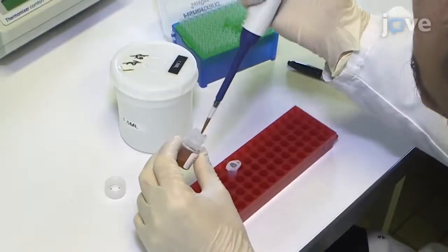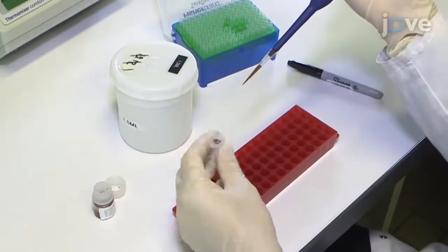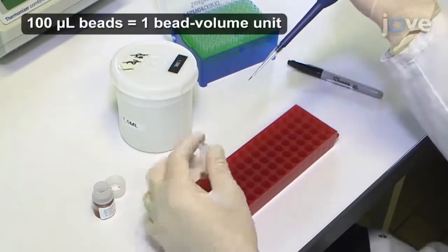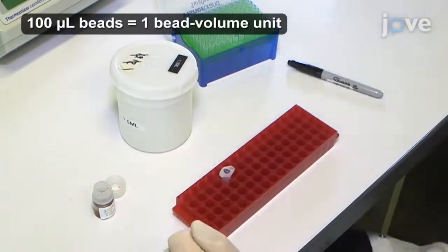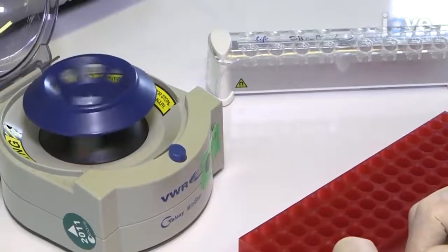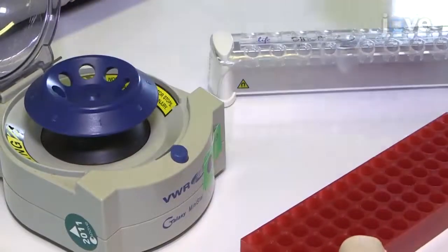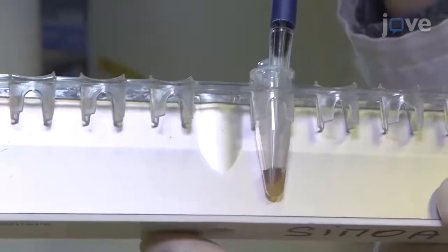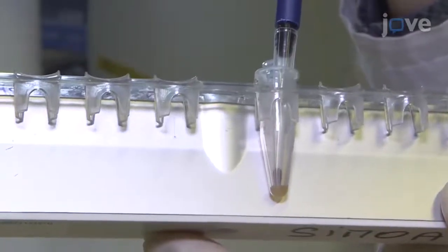To begin, load 280 million paramagnetic beads into a microfuge tube, taking note of the volume. Then pulse-spin the beads and put the tube on a magnetic separator for a minute. Remove and discard the diluent solution, thus isolating the beads.